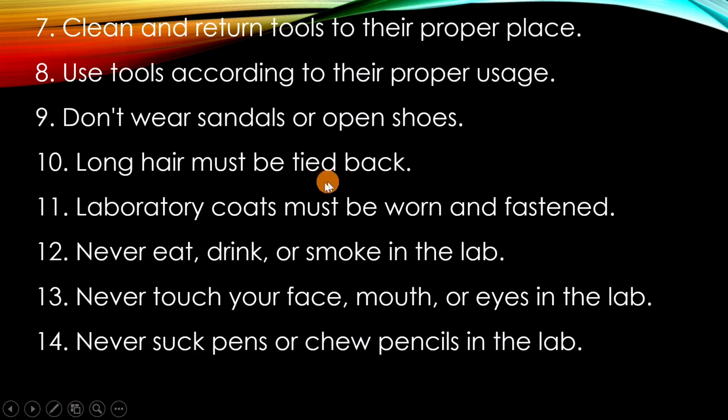Then don't wear sandals or open shoes when you are in the laboratory. In case of spillage of corrosive chemicals, so that you might not be harmed, you need to wear closed shoes. So long hair must be tied back.